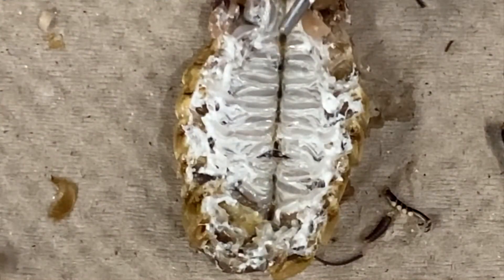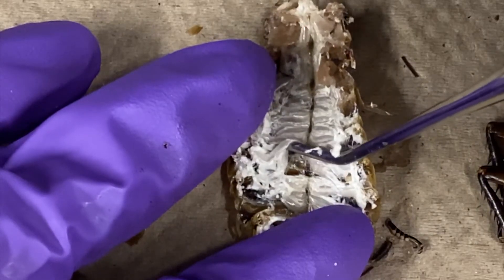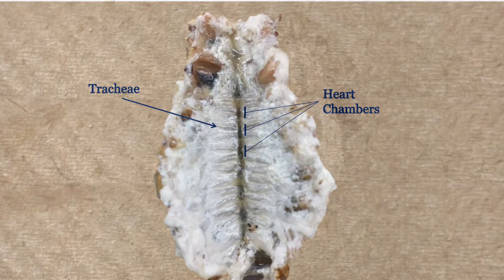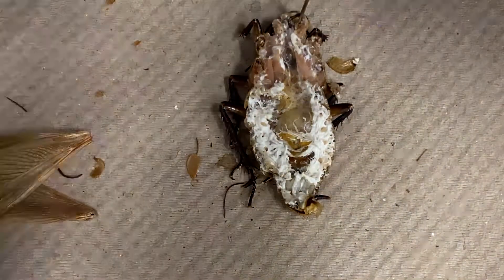Place the tergum on its dorsal side. The heart chambers should be visible. You should also be able to see the trachea, which look like shiny white branching tubes. Put aside the tergum and pin the cockroach ventral side down.